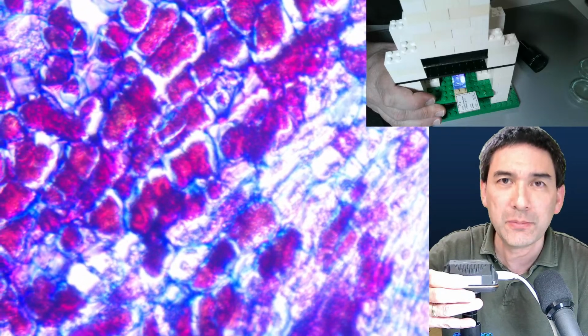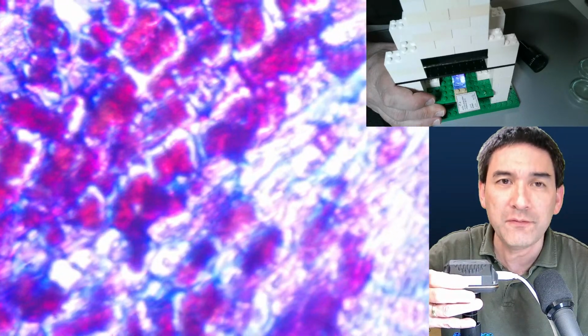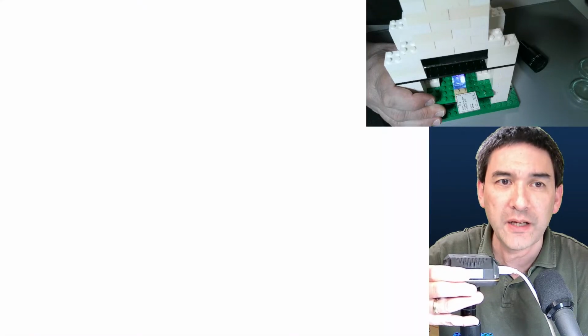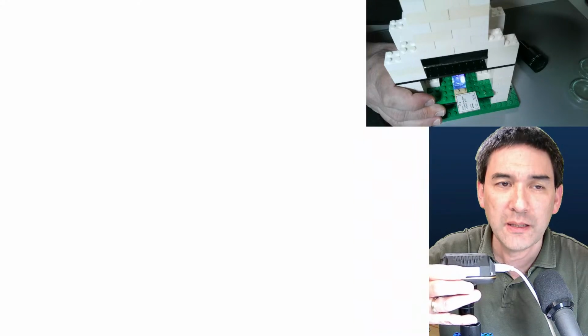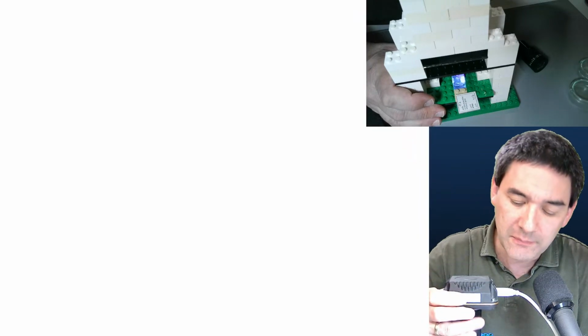So it is possible indeed to change the magnification by changing the distances. Ignore the fact that it goes out of focus, but if I push it upwards, then the image does become bigger. You have to readjust the image, so it is possible indeed to do that.